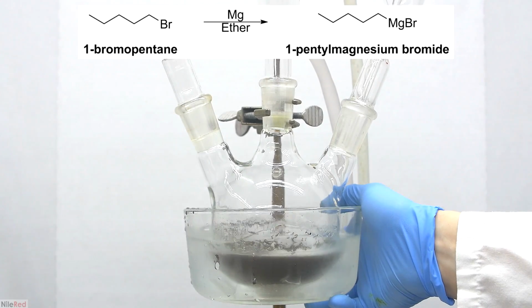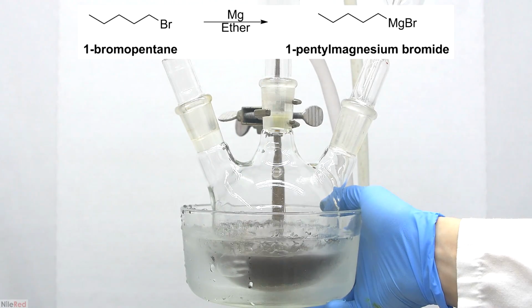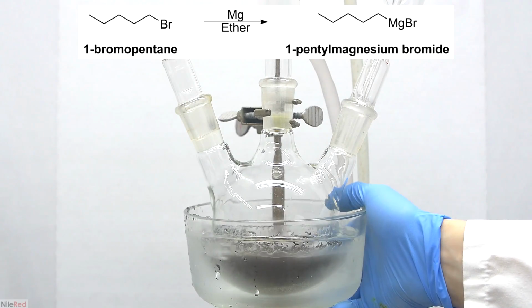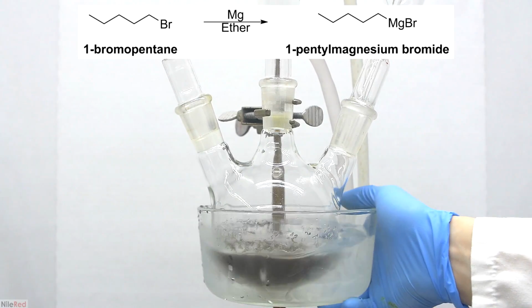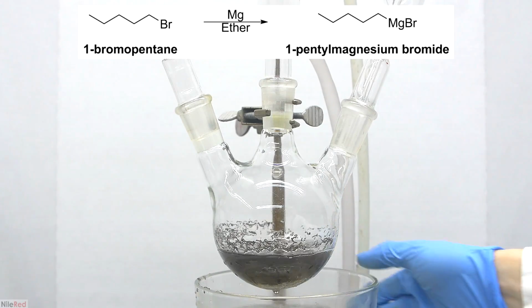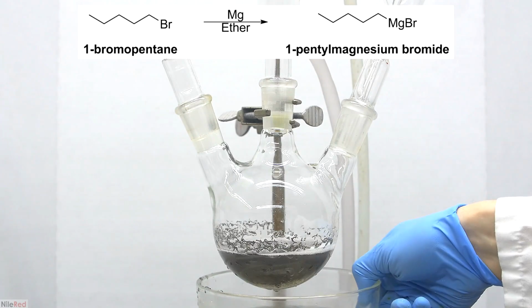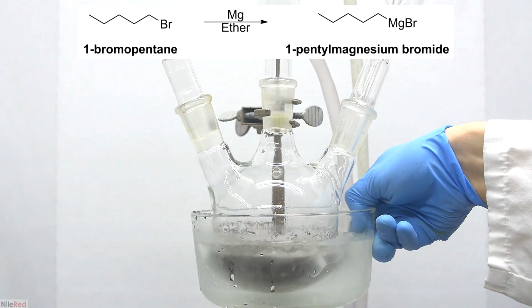Grignard reagents are quite reactive in general, and they react quite readily with water. This is why we need to limit the amount of moisture that gets into the system using the drying tube, because moisture will react with the Grignard reagent and it will reduce our yield. It's also the reason why all of the solvents and the reagents that we use have to be dry. The 1-bromopentane and the diethyl ether are kept dry by storing them over molecular sieves, and the magnesium is dried in an oven. To further reduce moisture content, it's also pretty common to dry glassware in an oven before the reaction.